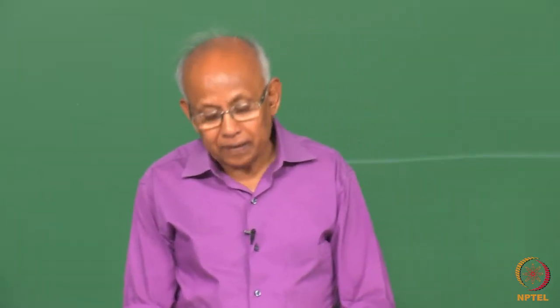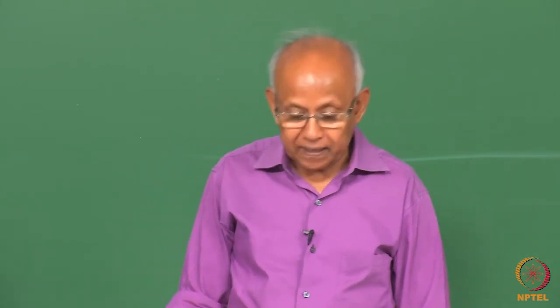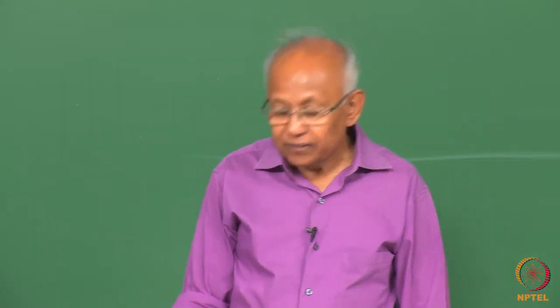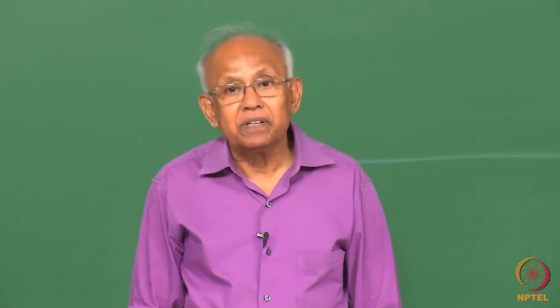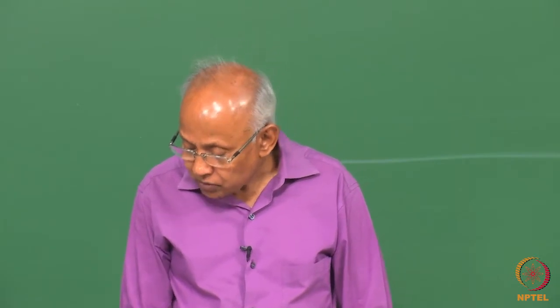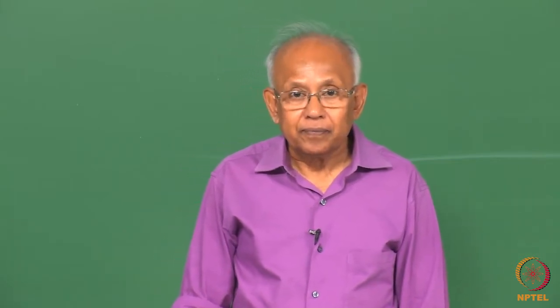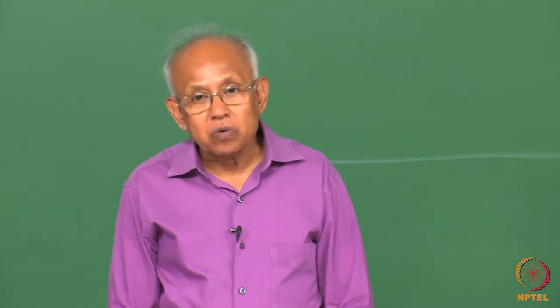In this lecture, I shall deal with the method of acquiring X-ray diffraction patterns using a diffractometer. First, I will discuss the fundamental concepts and the design of a diffractometer. Then I will talk about the measurement of XRD patterns using counters.